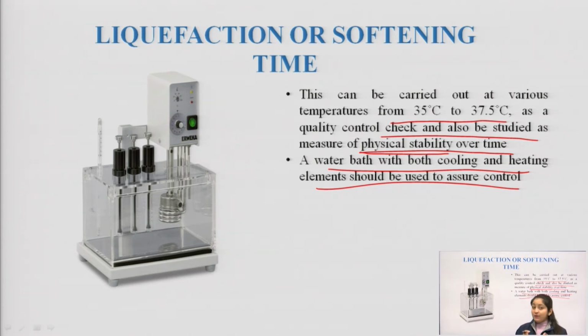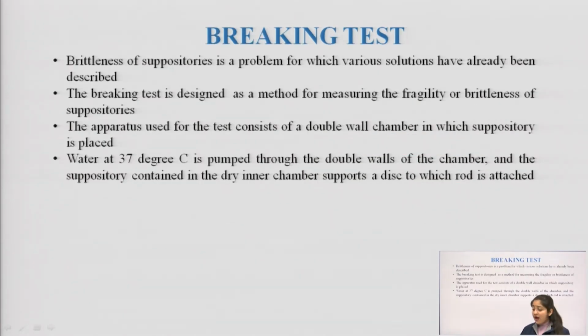So, this is a very important test, and here we can very clearly see this diagram, which shows how a testing apparatus for suppositories looks, and how liquefaction or softening time can be measured by working on this apparatus. Now, let us move on towards the next test, known as the breaking test.